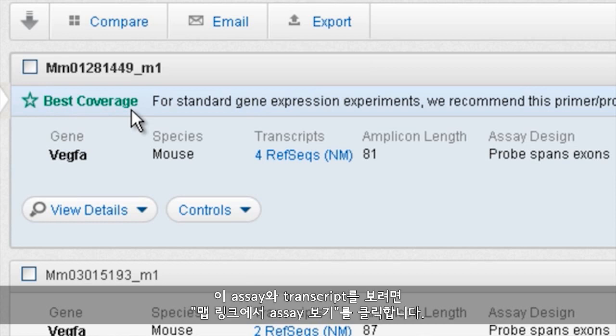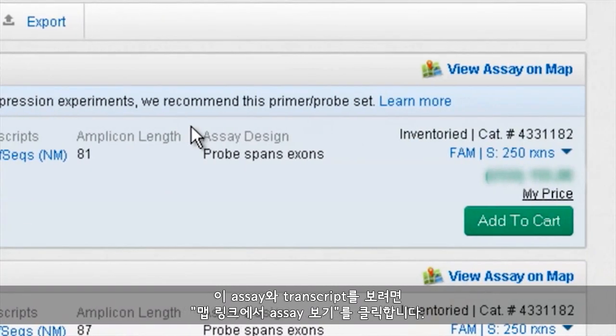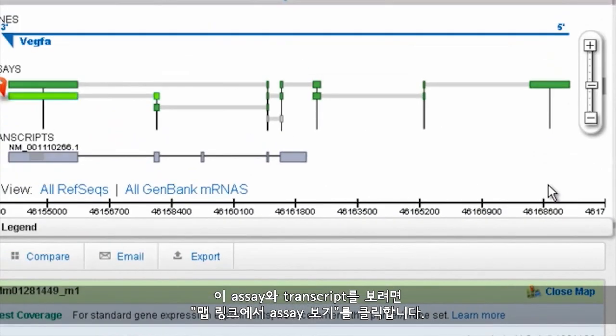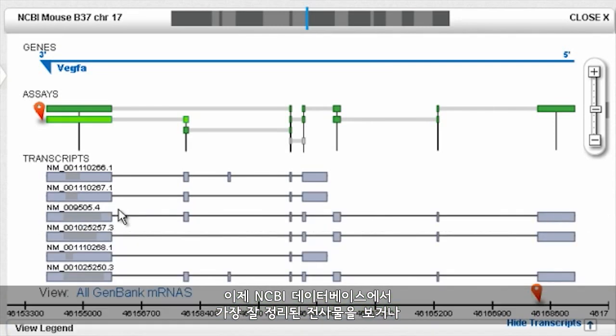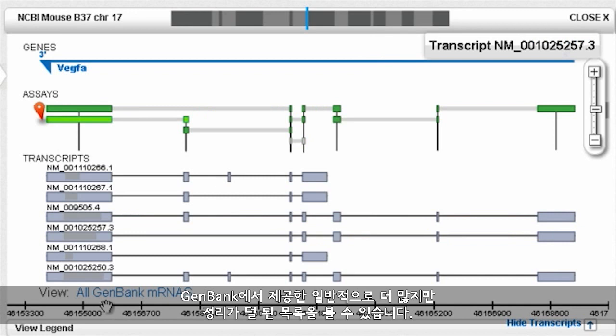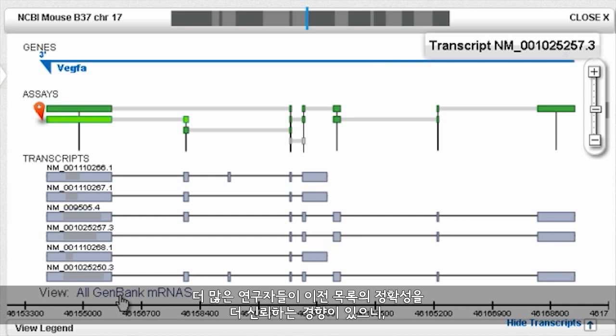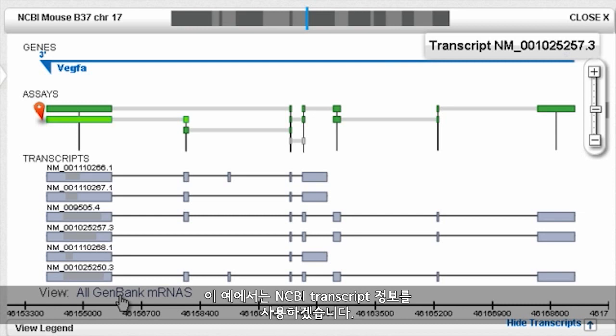To have a look at the assays and transcripts, let's click on the View Assay on Map link. We can now choose to see only the highly curated transcripts recognized by NCBI's database, or to also view the generally more abundant but less curated list provided by GenBank. Since most researchers tend to trust the accuracy of the former list more, we'll use just the NCBI transcript information for this example.